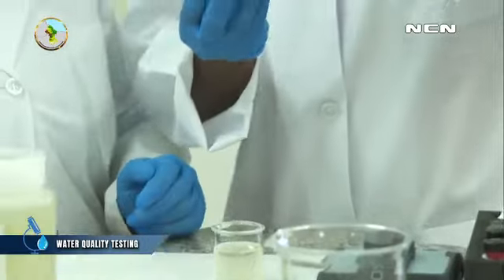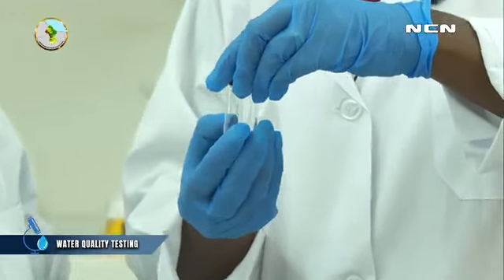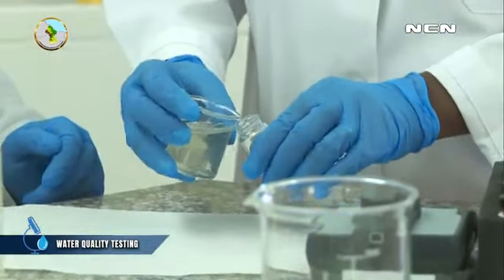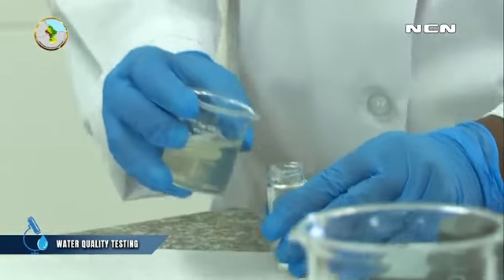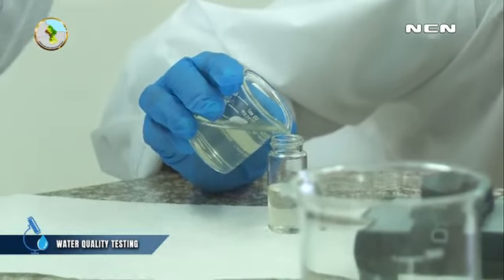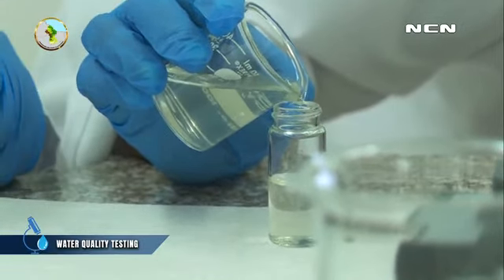So you see there is a line here on our sample cell, right? Mm-hmm. This is up to where we're going to be filling up the water. Not more than the line.